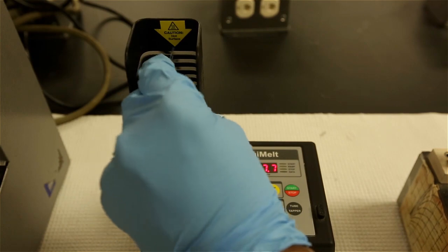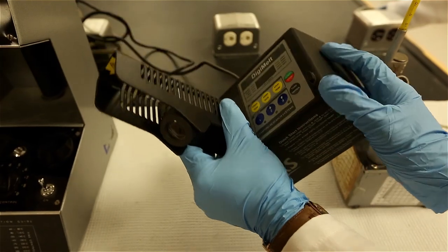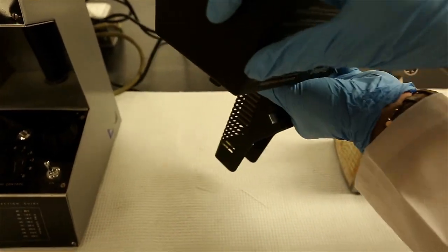If a capillary tube ever breaks in the instrument, carefully flip the instrument upside down to remove the broken glass and then dispose the broken glass in the broken glass container and not the wastebasket.